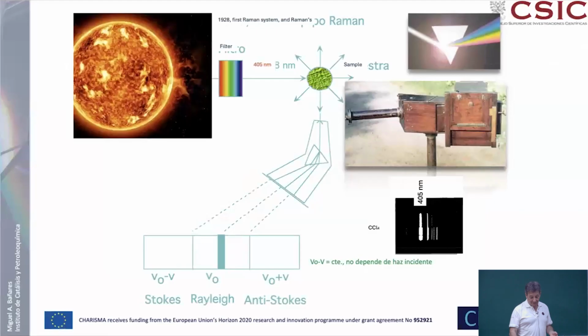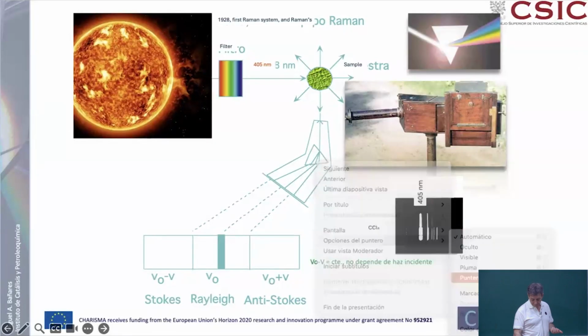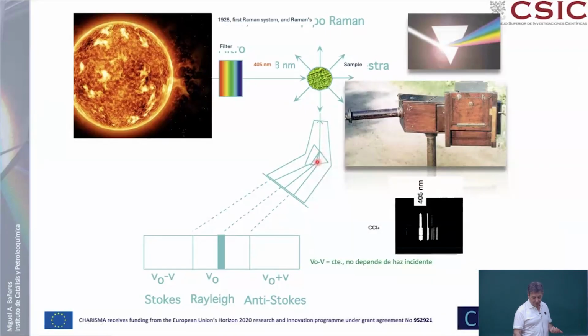So essentially this is what he did. So you have a prism in here. This tube is basically looking at the sample which is illuminated by the sun. And over here, basically, you have a photographic film where the light coming from the sample is impinging, incident. And the way it looks like, basically, this looks like a horn, something like that. So this is like a horn. So here you have the prism, and then the light goes to it.